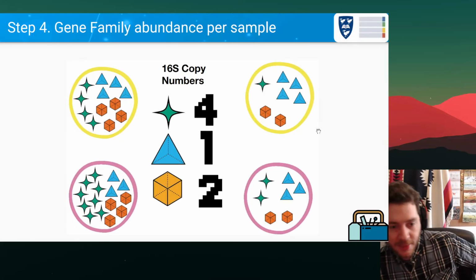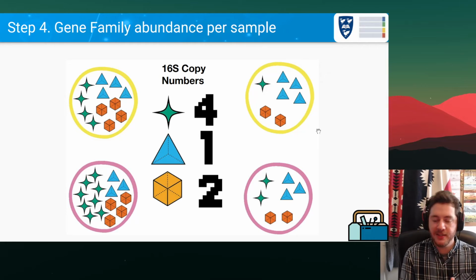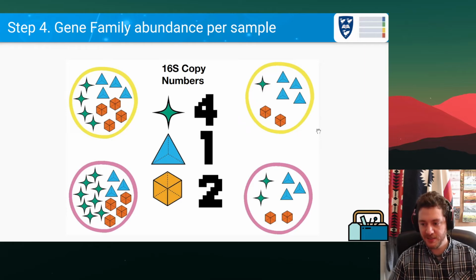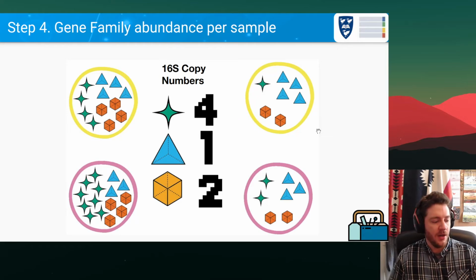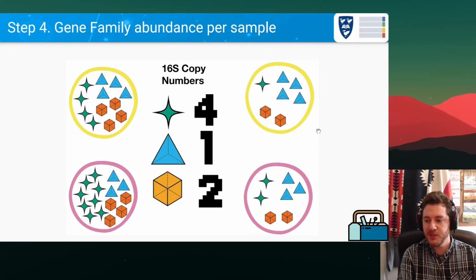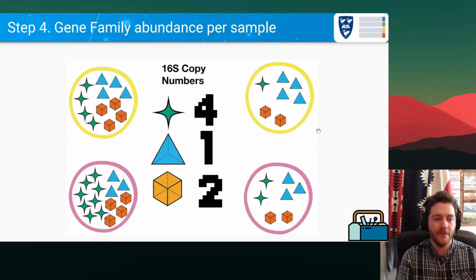So this is an important note. It's a slightly controversial thing. Some people, so PICRUSt2 developers, think you should do it, but nobody else does this. And whether you should or not, I think the consensus, generally speaking, is to not do this. But when we analyze 16S data, we are naively saying that every single 16S sequence is one individual, and came from only one individual.